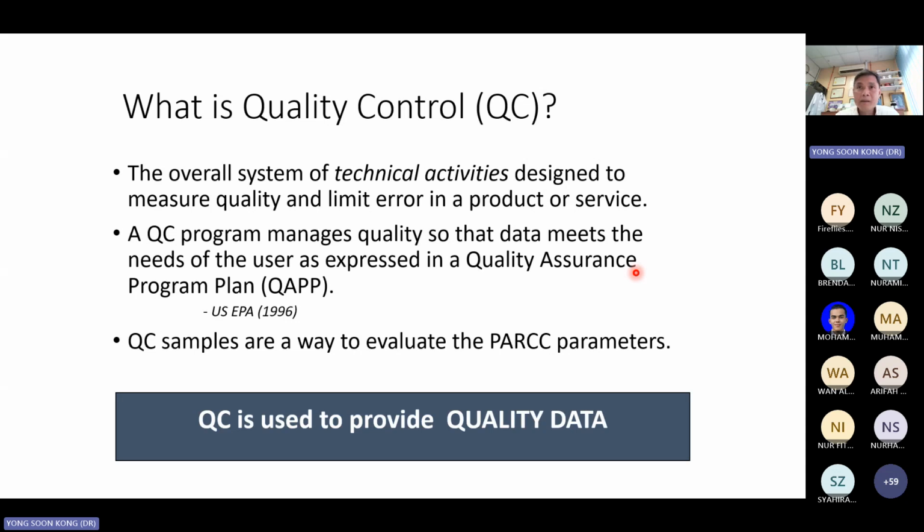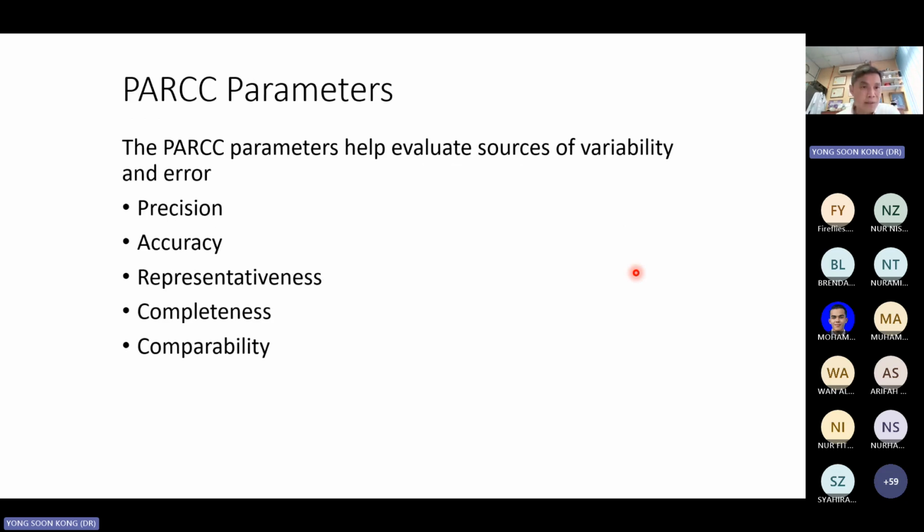Okay. So by the time during the day or a few days before the field trip, you're preparing the bottles, you're washing them, you are introducing the field blanks or whatnot. These are the hands-on things, the procedure that you're doing, and that falls under QC. Okay. So assuming that you know what is going on here, continue with the next one.